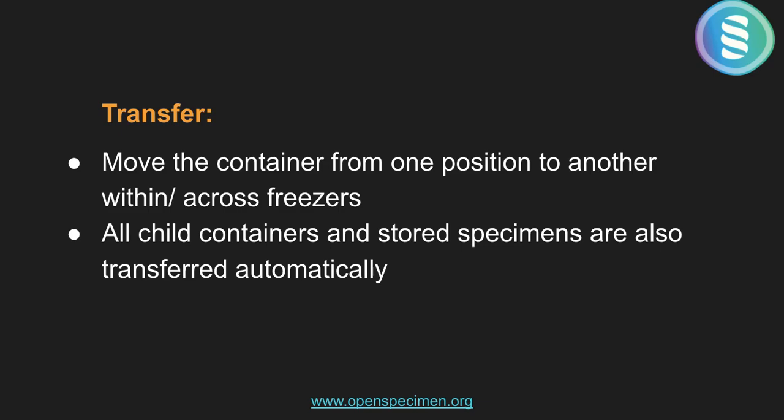That will be helpful to consolidate or rearrange their freezers, move racks from one freezer to another, move specific boxes according to the new rearrangement schemes. So from now onwards, OpenSpecimen supports transfer to move the containers from one position to another within or across the freezers. All the child containers and stored specimens are also transferred automatically.